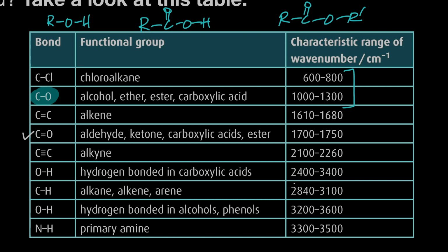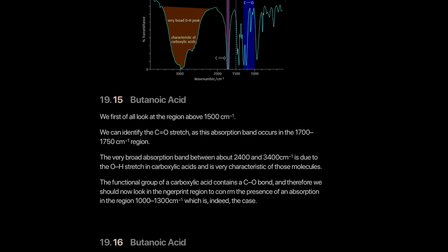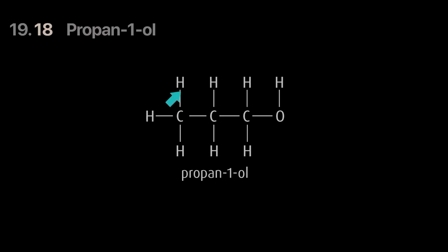But they will be telling you the molecular formula or even the elements involved. So if I told you that the compound only has carbon, oxygen, and hydrogen, and you had a value near 3500, the only possibility was an OH group. Which means that by looking at the graph, I can confirm that it is an alcohol group. That's how it is, because look at all the molecule bonds here. All the CHs, CO, and OH. So there will be a CH spectrum, an OH spectrum, and a CO spectrum.